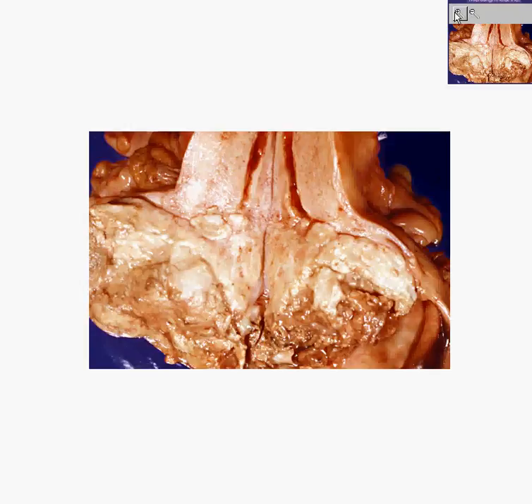Look here. It gets even bigger and bigger until you can see that what we have here is a uterus that has been cut longitudinally, and here is the endocervix along here, and perhaps the fundus would be above our field of view, but the lower endocervix extending to the vagina is this large tumor which has whiter areas, perhaps representing more fibrous tissue, as well as more irregular hemorrhagic areas, yellowish, perhaps representing necrosis and hemorrhage within this tumor.